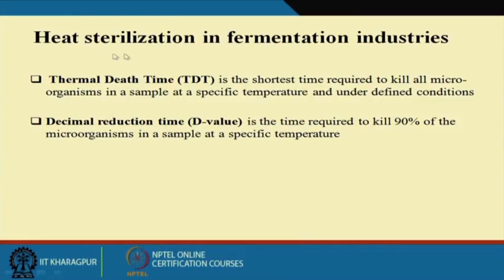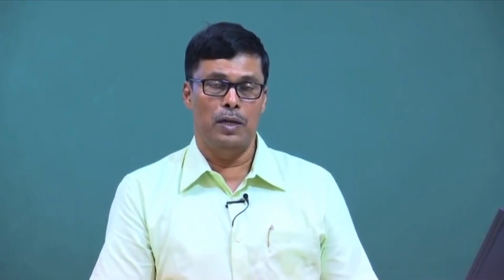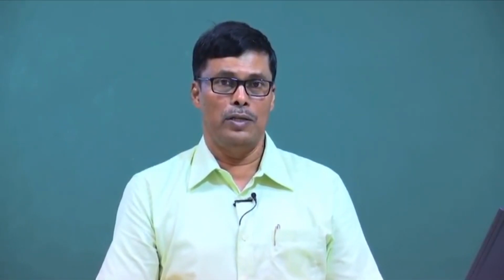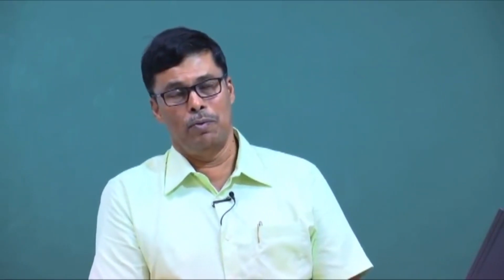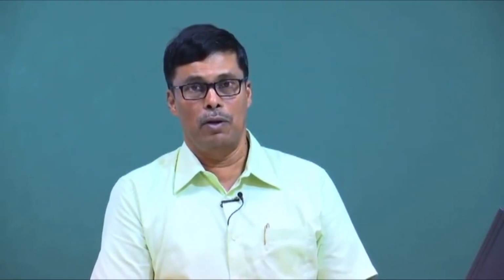Now in case of heat sterilization, which is in practice in the industry, we have thermal death time. It is the shortest time required to kill all the microorganisms in a sample at a specific temperature and defined condition. Now here I want to point out that whenever we design any kind of sterilization process, medium sterilization process for the industry, we never go for 100% sterilization. We always assume 1 out of 1 million, 1 out of 10 million, 1 out of 10,000 like this, as per the requirement of the process.